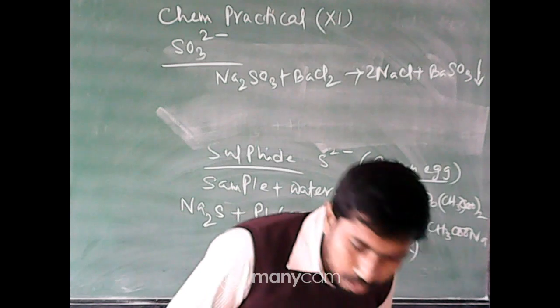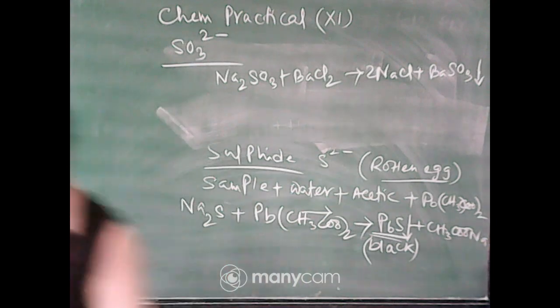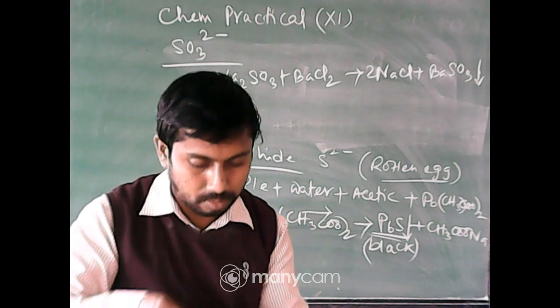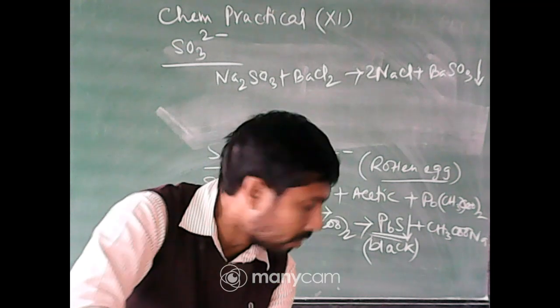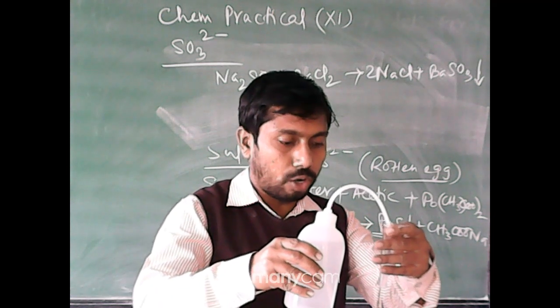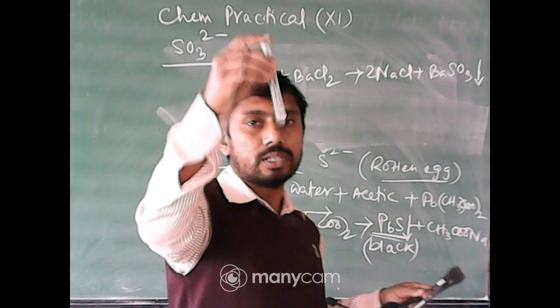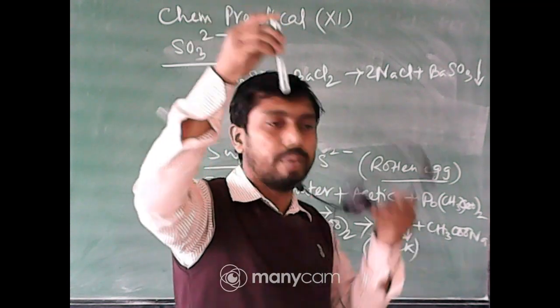Then the aqueous solution is prepared. Not too much water should be added, a very little amount just to dissolve it. When the solution becomes clear, yes, now it becomes clear.